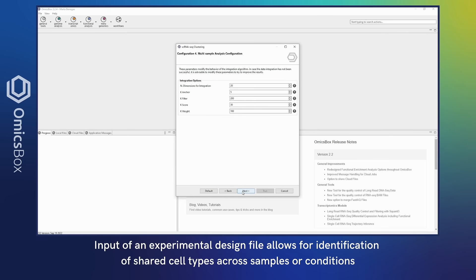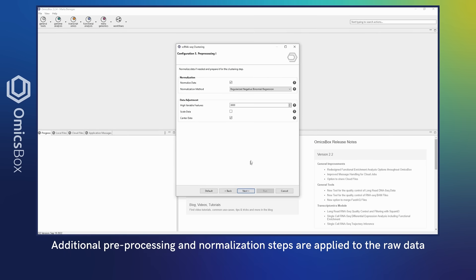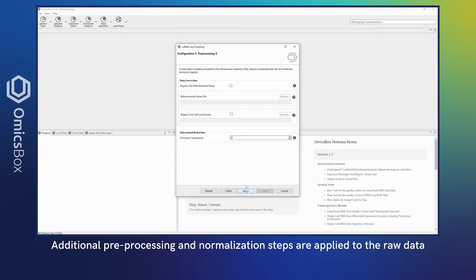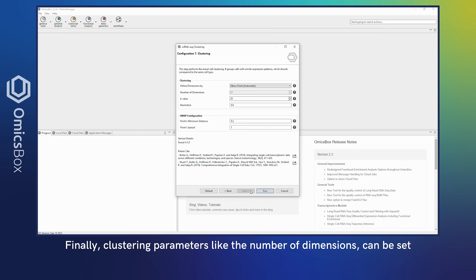Additional pre-processing and normalization steps are applied to the raw data. Finally, clustering parameters like the number of dimensions can be set.